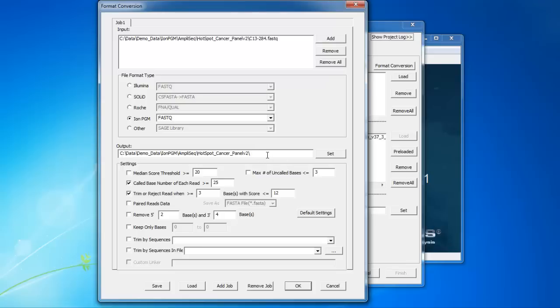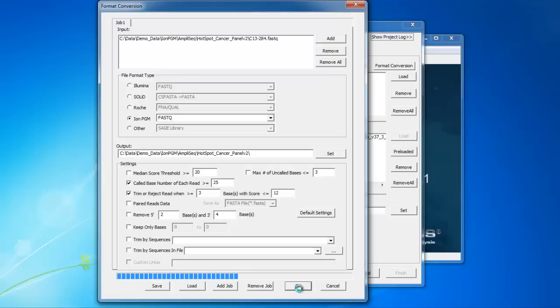In the bottom of the tool, there are different settings that can be used for quality filtering the data. The default settings work well for most datasets, but any of these settings can be adjusted as needed.